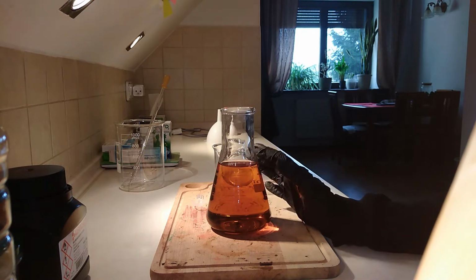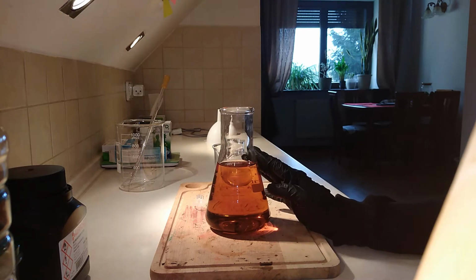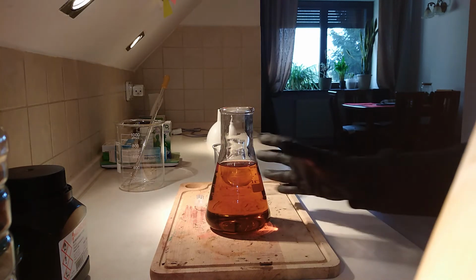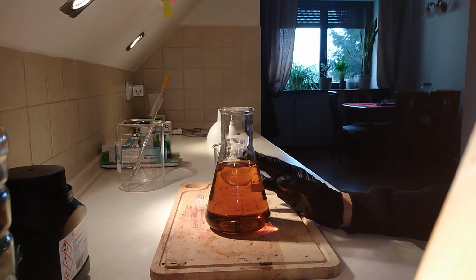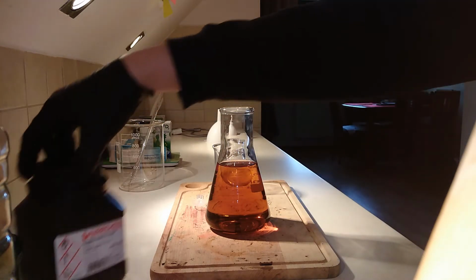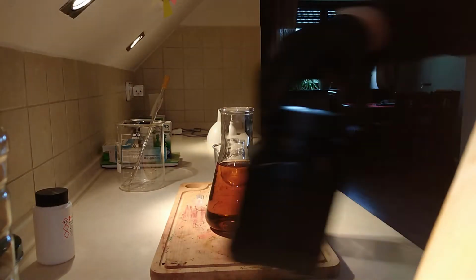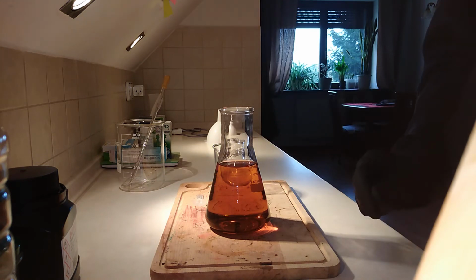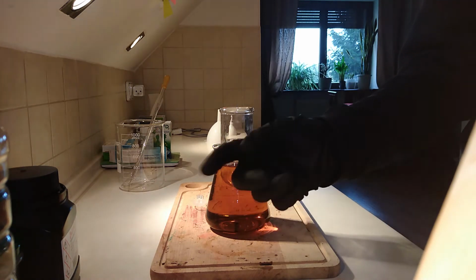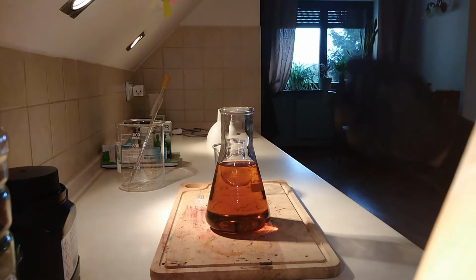I don't really know what the blue oxidation state is and what the compound is, but when it gets green, it becomes not potassium permanganate, but potassium manganate. So here we have KMnO4, but then it is K2MnO4.